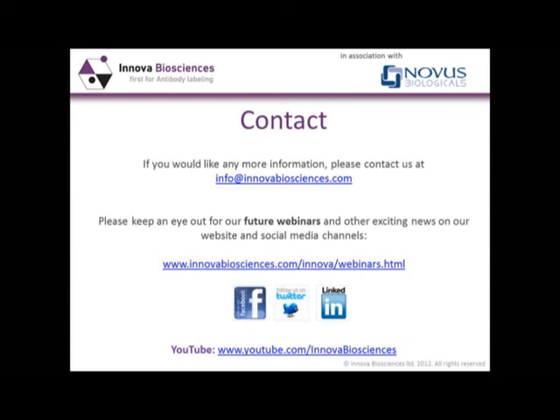Okay, so we have quite a few questions actually, so we'll try and get through as many as we can. I've just noticed one here that you might be able to answer, Andy. Okay, Graham, you had one in mind, I suspect. Is that the most recent one that's come through? No, this one is from Nina, and Nina's asking really whether the lightning link kits can be used to conjugate antibodies for in vivo use.